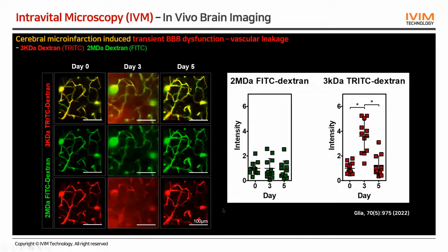We can test the delivery of material to the brain through the BBB, and it can be done in a single animal repetitively over several days or even over several weeks or up to several months as well.